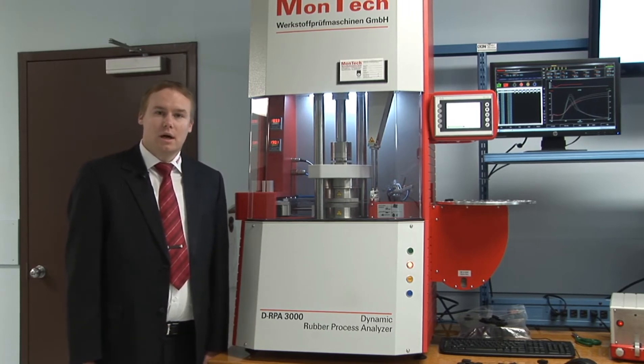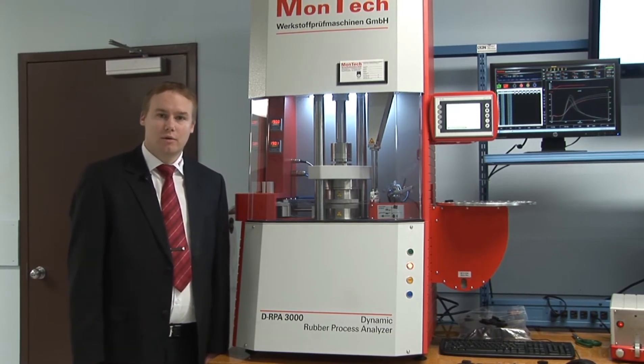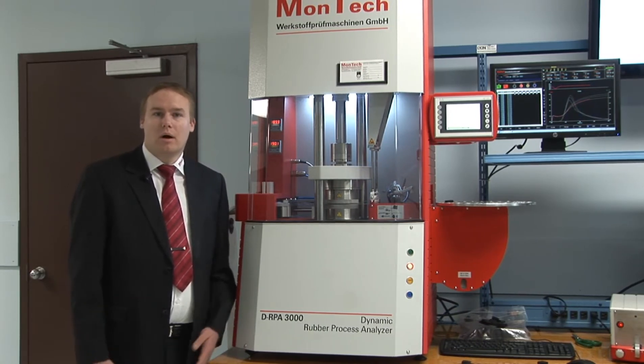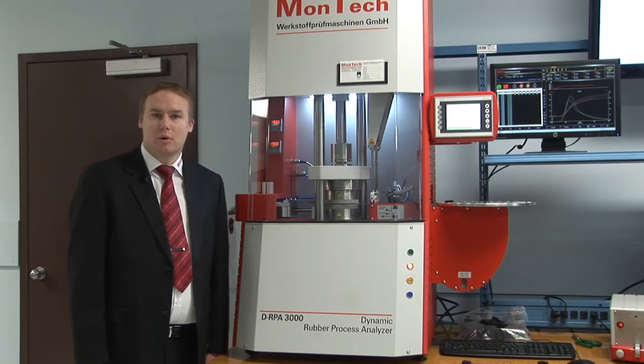All results are recorded digitally. Raw data is available on the computer and can easily be processed directly in the MonControl software. With one click you can print your test reports, or you can automatically export all the data to external programs such as Microsoft Excel or any other data processing program.